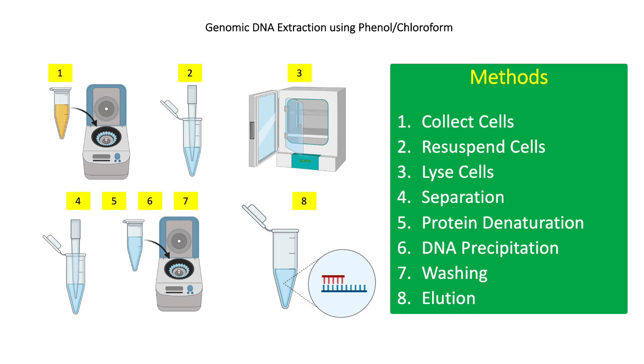For step 5, add 700 microliters of chloroform and mix well. This enhances the denaturation of the remaining proteins, phenols, and lipids in the solution. Chloroform also enhances the separation of the organic phase and the aqueous phase, which contains the DNA. Centrifuge at 13,000 RPM for 10 minutes, pipette the aqueous phase, and transfer into a new tube. Repeat once.